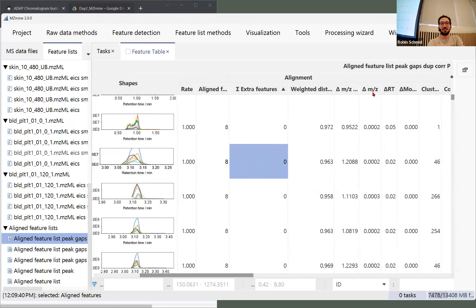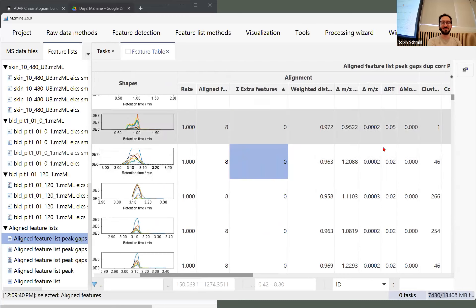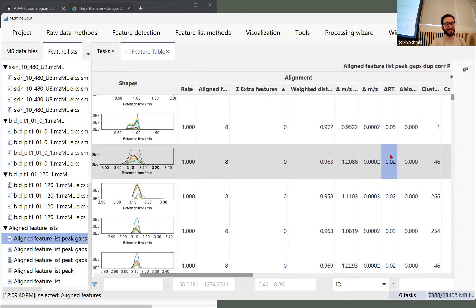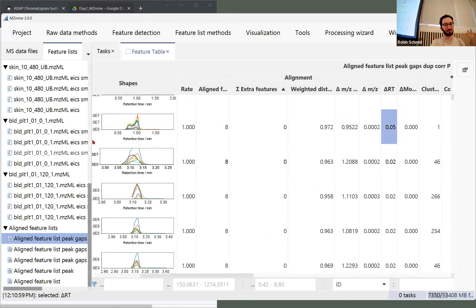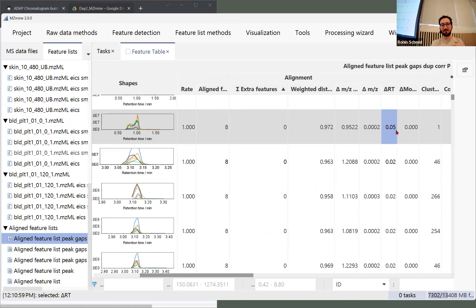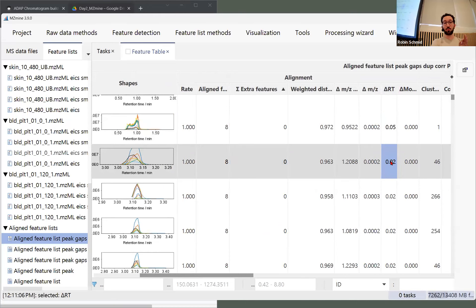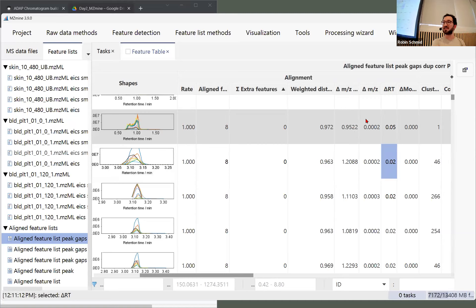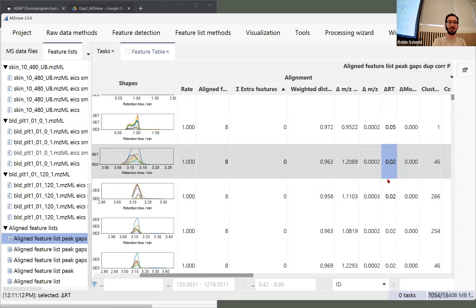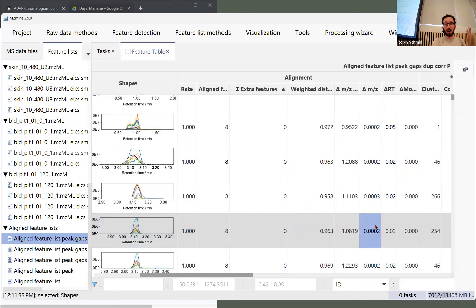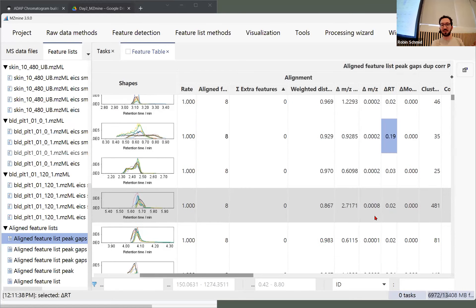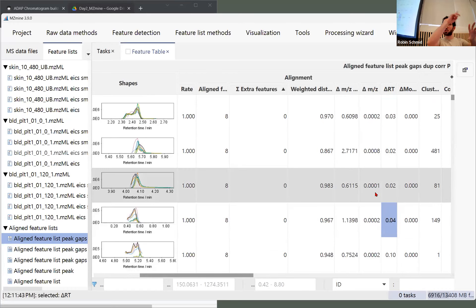Only one feature per sample can be aligned to a row, so if we have two in a sample, one becomes an extra feature. It's nice to find features with full alignment rate, zero extra features, no isomer or shoulder that could mess up alignment. Looking at the maximum delta m/z and maximum delta retention time — some features have weird shapes with delta around 0.05, while good-shaped features show about 0.02. If you want more significant figures, go to preferences and adjust the formatters, then reopen the feature list.